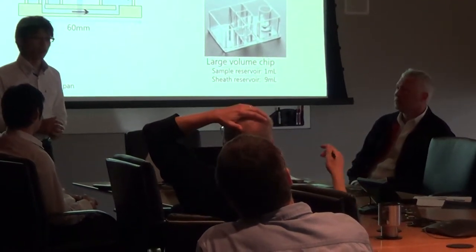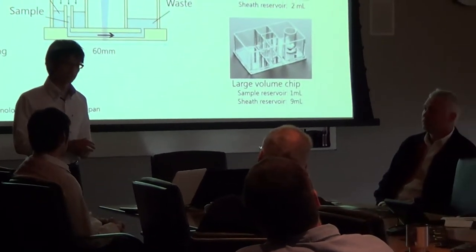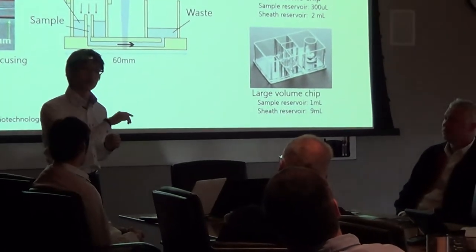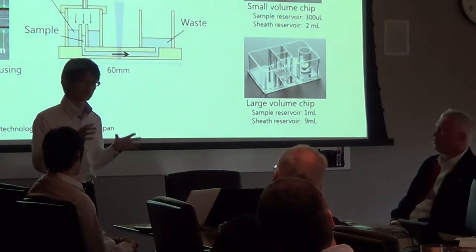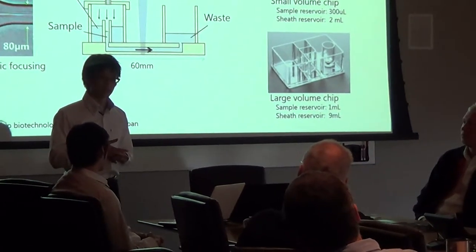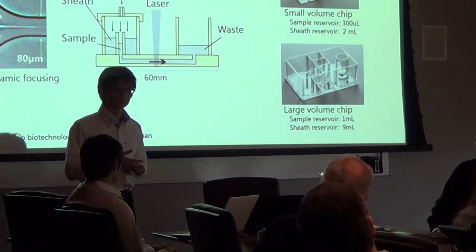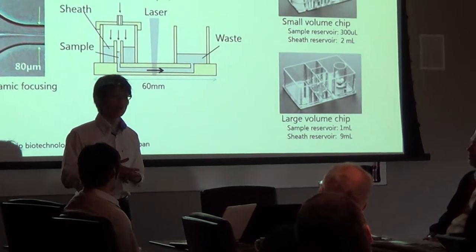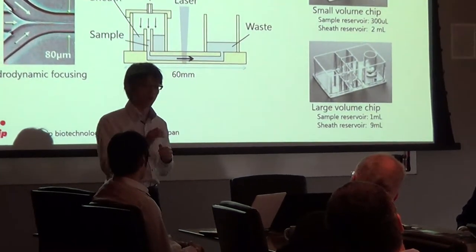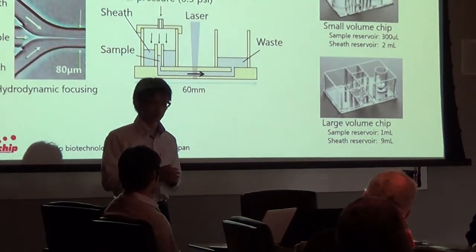That's totally right. And with our case as well, by changing, say, the pressure that's been applied to the sample and also the sheaths, we can actually adjust that as well. If that answers your question. Well, but with what we're running off, we just use air pressure, so we cannot change that. Oh, well, no, just with air pressure we can actually control how much of a push you have. Yeah, so we're pretty flexible with that.